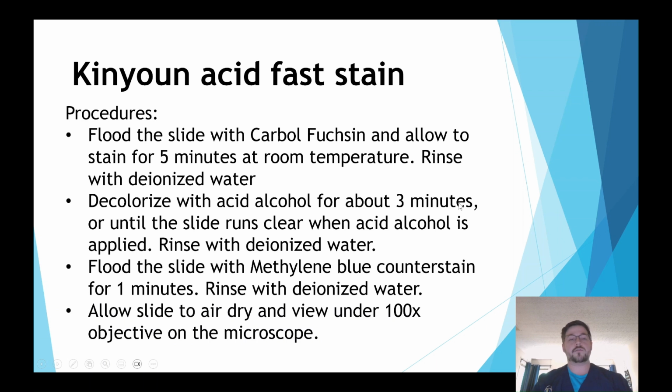And the way you're going to do this is you can add it to the slide and then remove it, and then just keep adding it for about 3 minutes until you see that it's no longer releasing color. After that, you'll rinse it again with deionized water, and then flood the slide with methylene blue counterstain for about 1 minute. Then you'll rinse it with the deionized water again, and you'll be able to view it under the microscope after.